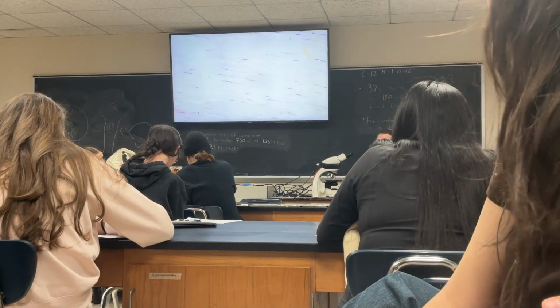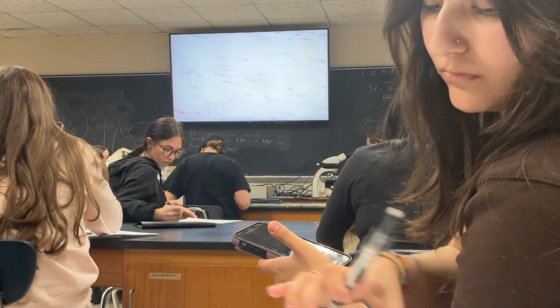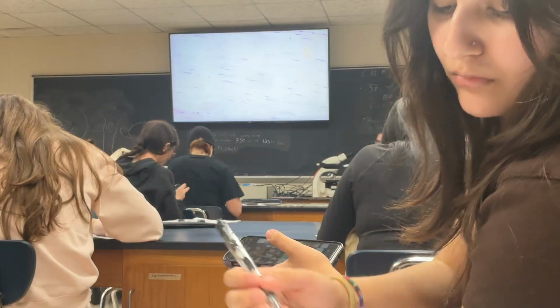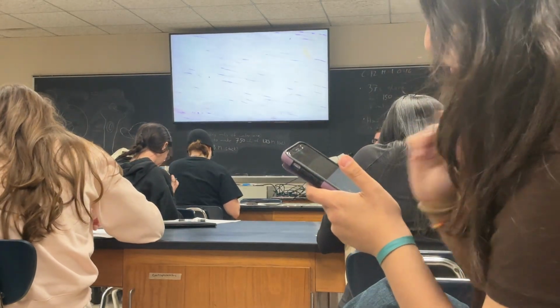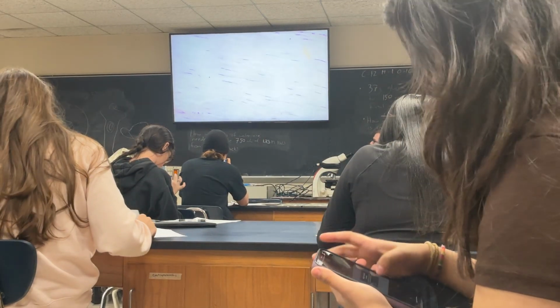This is dense regular connective tissue. This is number 6 at the bottom of page 12. It's called white fibrous connective tissue there. The real name is dense regular connective tissue, okay? Now this slide is called white fibers, so you might be able to find it. It's in tendons, it's in ligaments.